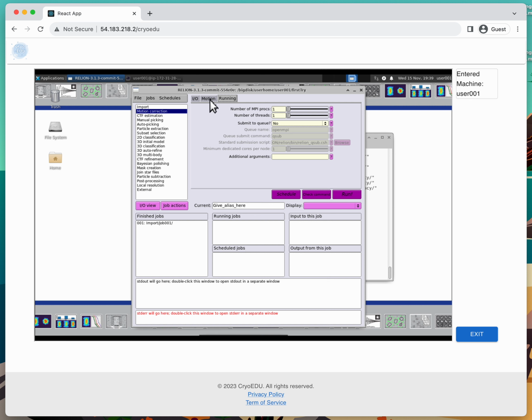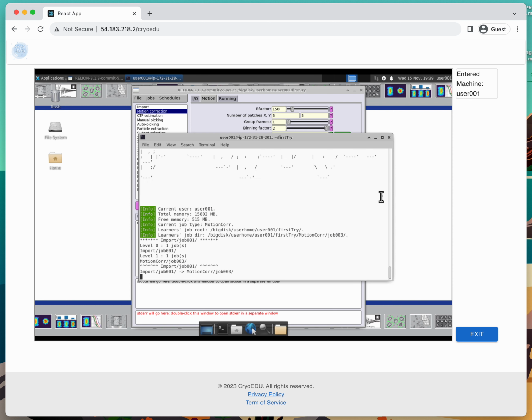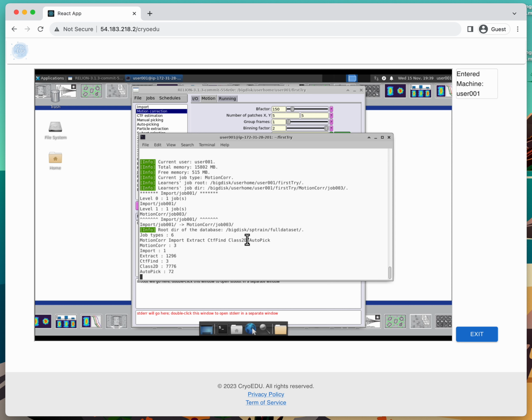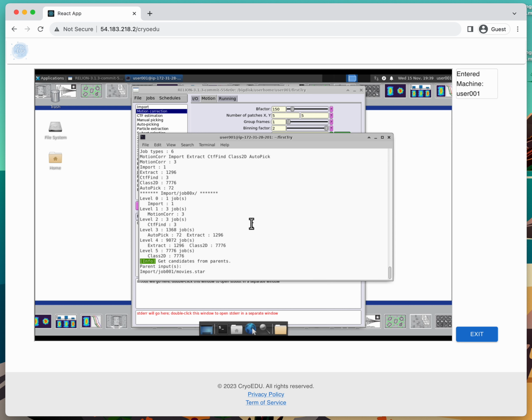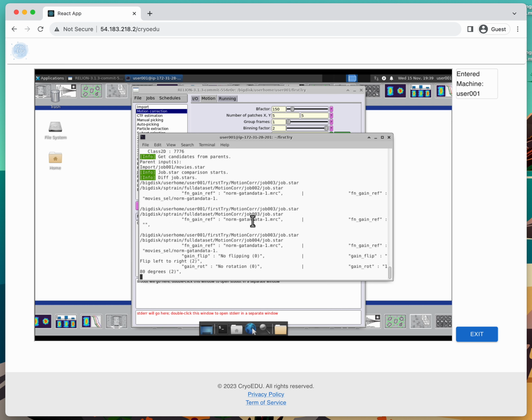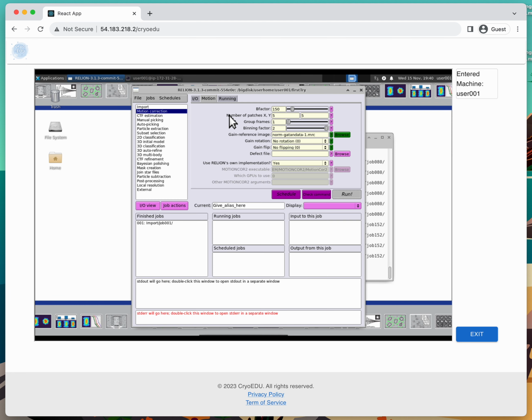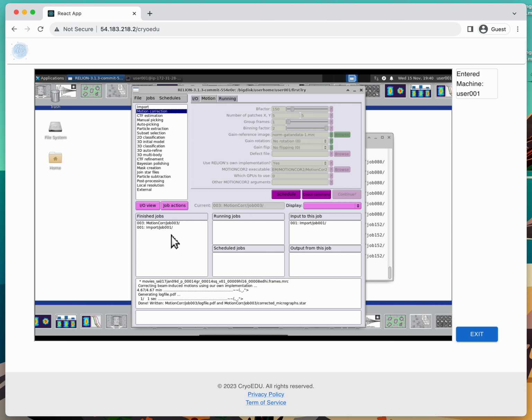We are just here to run motion, to simulate motion correction. So when this is all set up, we can click run. Just like other jobs, what you'll see is the back end on the terminal, our simulator is looking through our pre-calculated result database to find the job that corresponds to these parameters. So you're sort of sifting through information. Eventually, when it finds the right one, it'll come back and you'll see a finished job show up, like here.